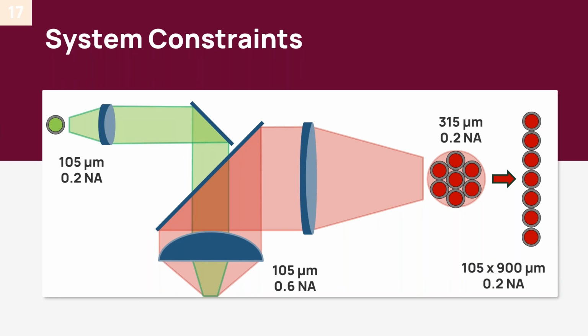and of course, the size of the NA scales by the square root. So 3 times the NA means you can collect for 9 times the area, basically, when it comes to angle, 9 times the power if the power is evenly distributed. And putting a 0.6 NA into a spectrometer is not that practical.